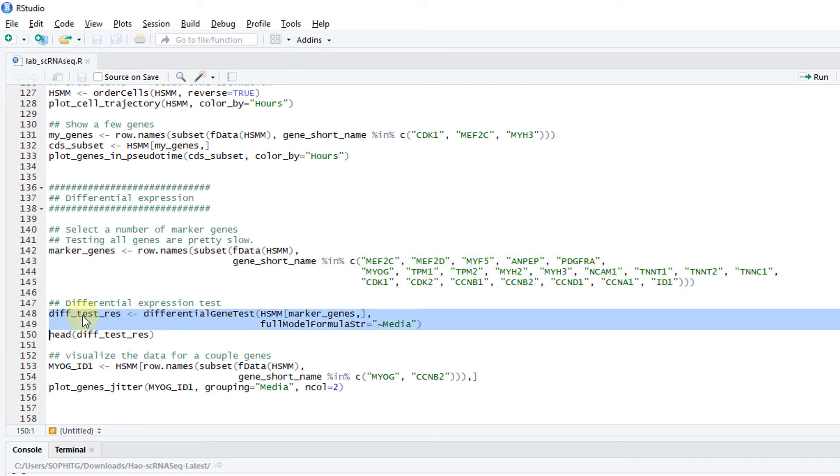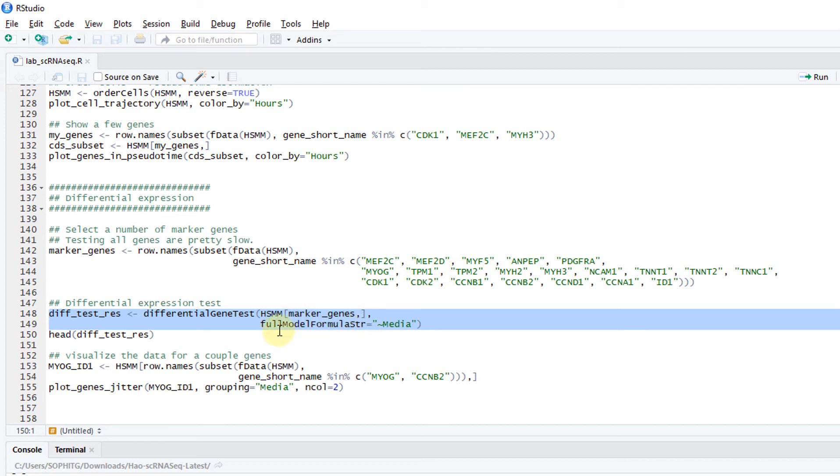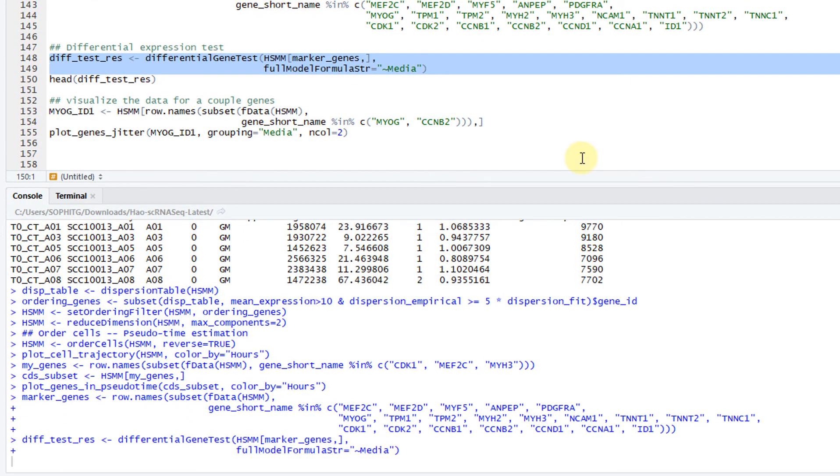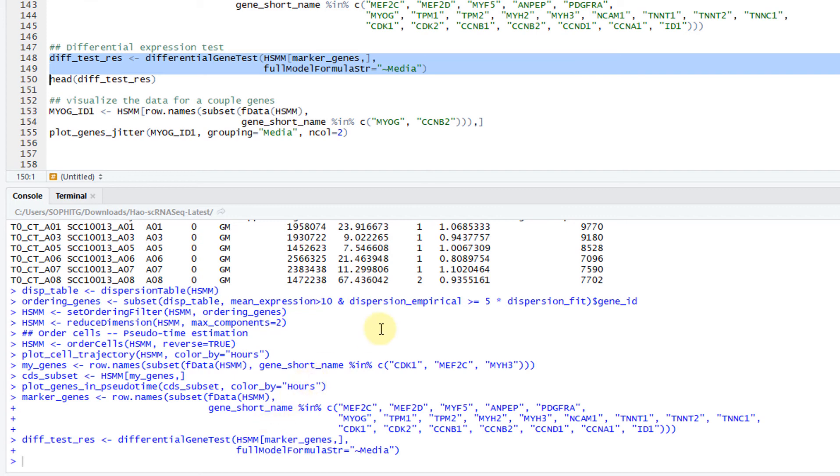I'm only doing DE for these genes. The function is called differential gene test. You specify the data. Here the data, I'm only taking the data for these few genes. Then my full model is media, testing the differences between media. It's kind of slow in here. For only testing a handful of genes takes some time. I tried to run this on the whole data set. It just takes forever.